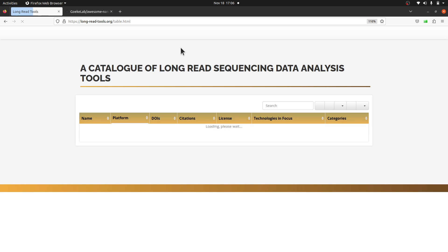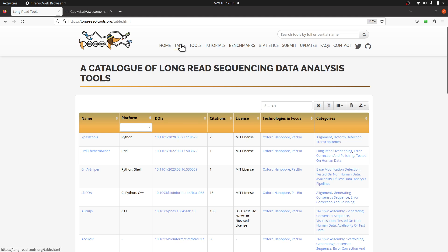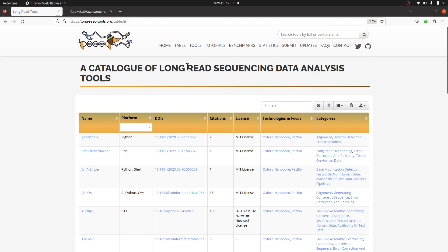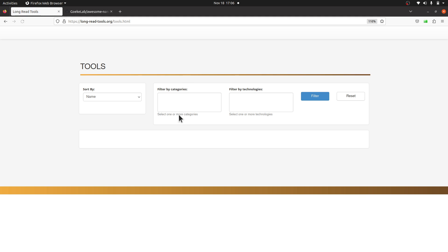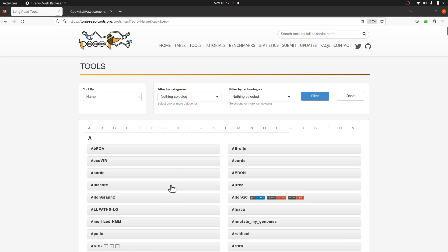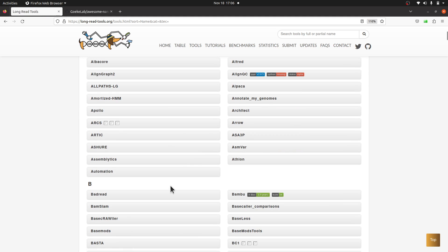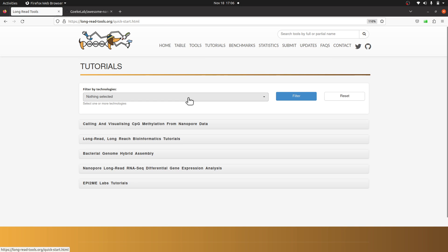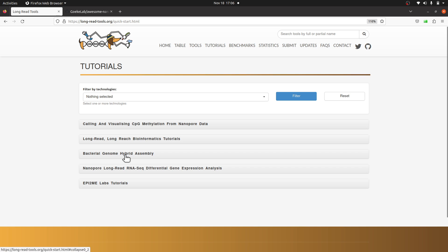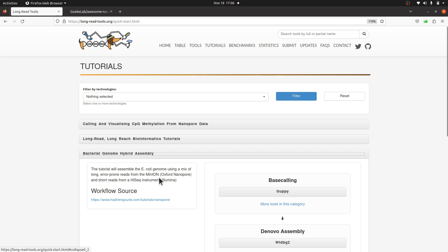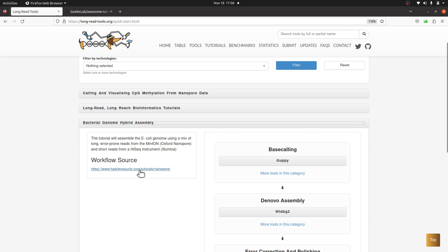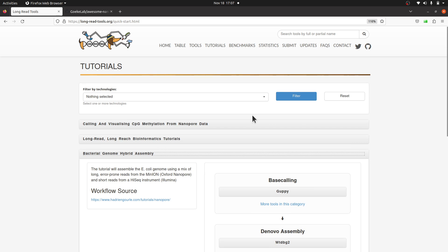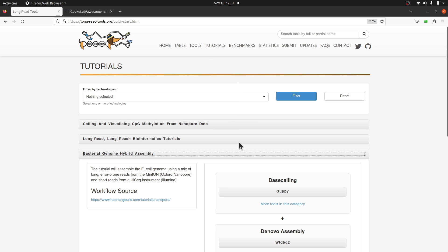You can go back to home. This is home. Let's go to table. When we are here, you see all this. You can also click on tools. It is more like a text mine and basically you are searching for information. You can also look at tutorials. We have long-read bacterial genome hybrid assembly. You can click this and just check what is there. There are various links here, so you can just use and get more tutorials as well, and benchmarks.